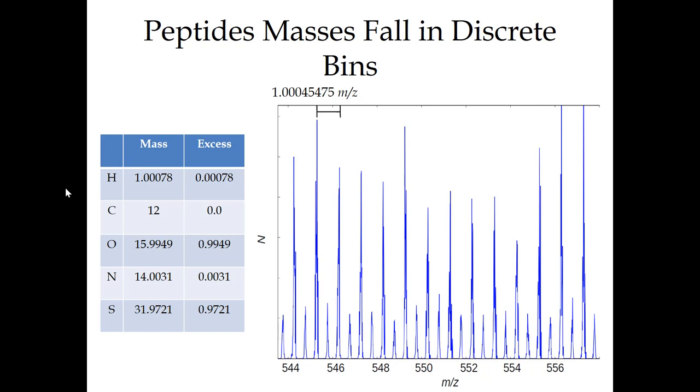So this is a plot that shows fragment ion mass to charge versus prevalence of fragment ions. So this is if I took, theoretically, say, all of the peptides that I've ever detected, I think this is in worm, and I said, what are the fragment ion mass to charges of the Y ion series for all of them? And this is showing what the histogram, what the distribution is of occurrence of those masses.